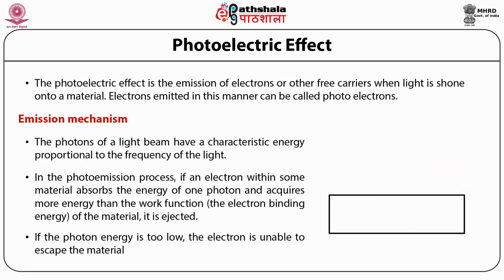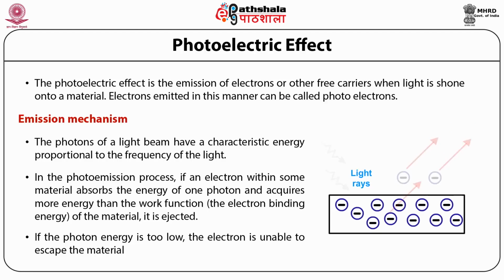Electrons can absorb energy from photons when irradiated, but they usually follow an all or nothing principle. All of the energy from one photon must be absorbed and used to liberate one electron from atomic binding, or else the energy is re-emitted. If the photon energy is absorbed, some of the energy liberates the electron from the atom, and the rest contributes to the electron's kinetic energy as a free particle.